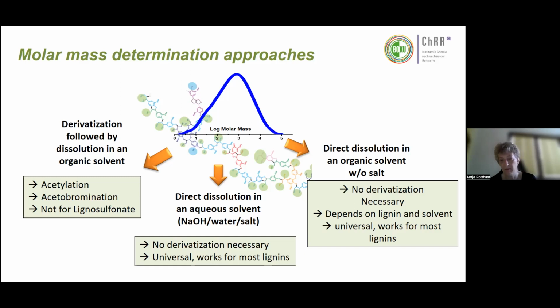If you take it on a long run, it's not 100% clear how stable the lignins are in that sodium hydroxide solution. And when you think about light scattering and aqueous solvents, that is also not the perfect choice. If you have the choice between an organic solvent and an aqueous solvent in light scattering, always go for the organic solvent, because water attracts a lot of dust, and this is usually a problem in light scattering. You cannot use all angles in light scattering, so there are certain restrictions for water. So my preference, if I can, is always an organic solvent.